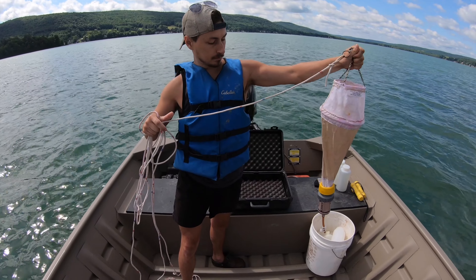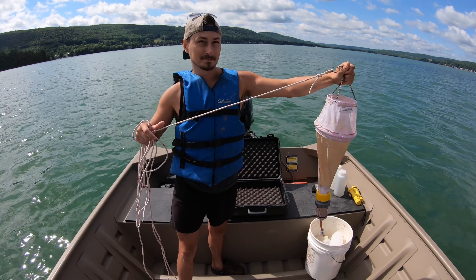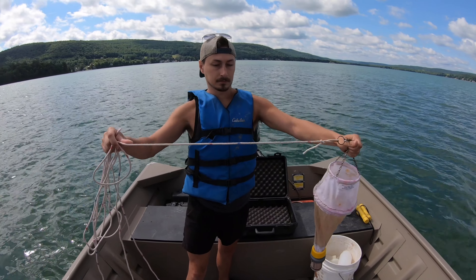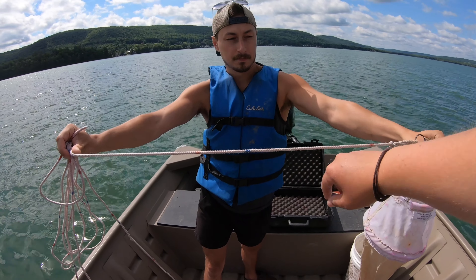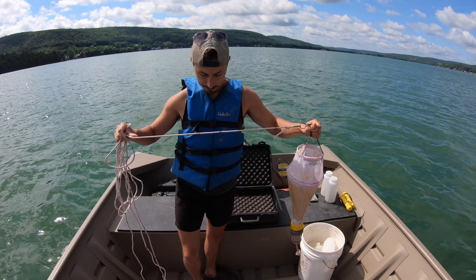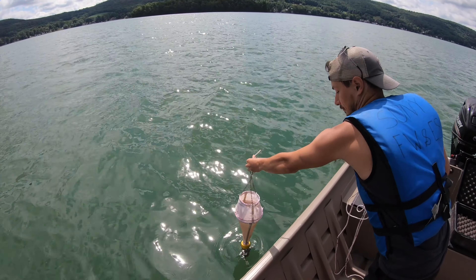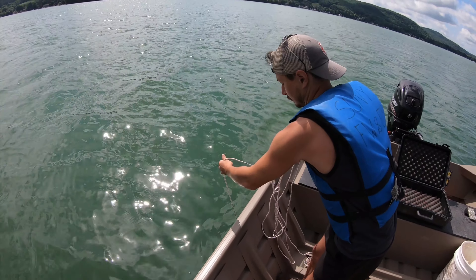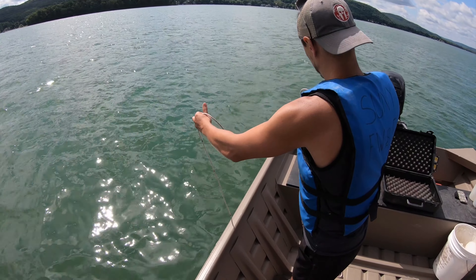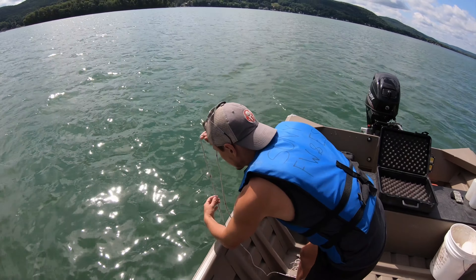We just did our water quality monitoring with our YSI and determined the thermocline. Matt's going to send this net down and we're going to do a vertical tow off the side of the boat. There are increments on the line — red marks are feet and blue marks are half meters. Today we're doing ours in feet. Matt's going to lower it down to where our thermocline was and do a vertical tow up. It's a little windy, so sometimes it goes underneath the boat. He's going to go right to the water's edge and then pull it up, bringing all the line into the boat.